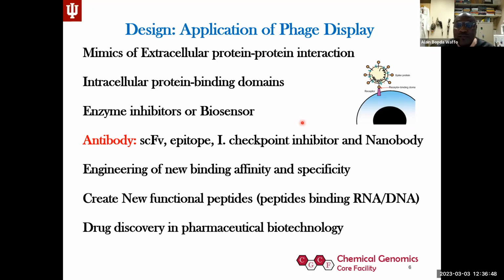Yeah, so I have a question here. Is it possible to design phage display protein that can interact with this RNA? Yeah, I have one with a PI here. He has his RNA, and he biotinylated it, and I use my library to see what are the peptides that can bind this RNA. Again, I can give you candidates, but to really tell which one is better, it's up to you. It may come down to 2 or 3, and that's it.